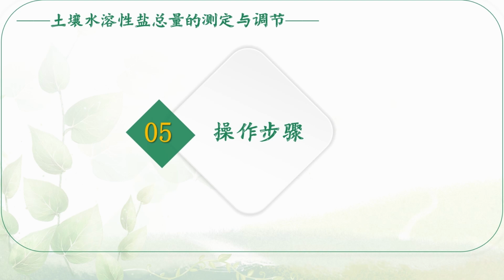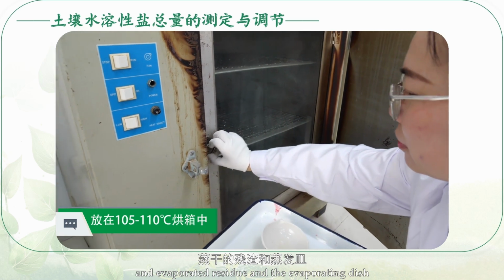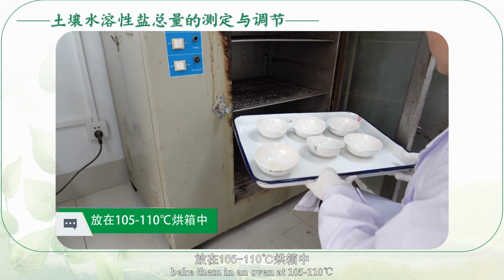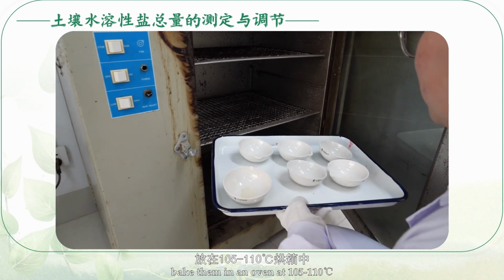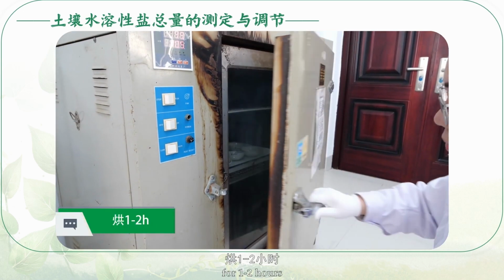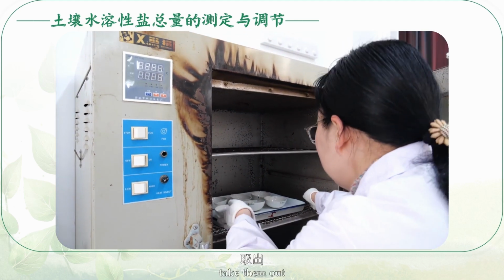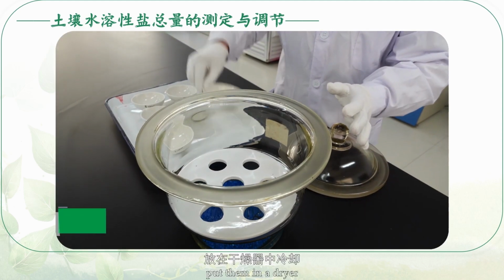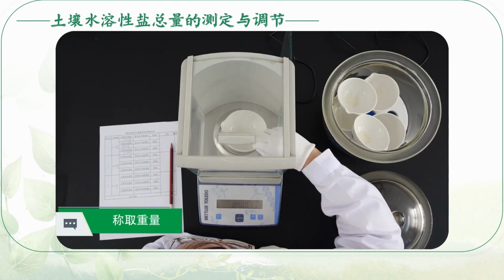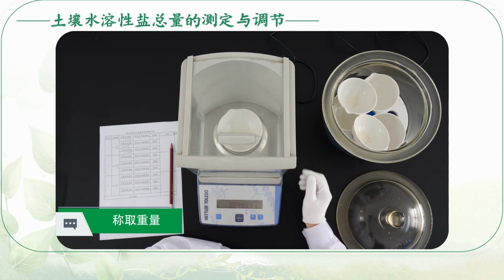5. Take the completely oxidized and evaporated residue and the evaporating dish. Bake them in an oven at 105 to 110 degrees Celsius for 1 or 2 hours. Take them out, put them in a dryer, cool them down, and weigh their quality with an analytical balance.